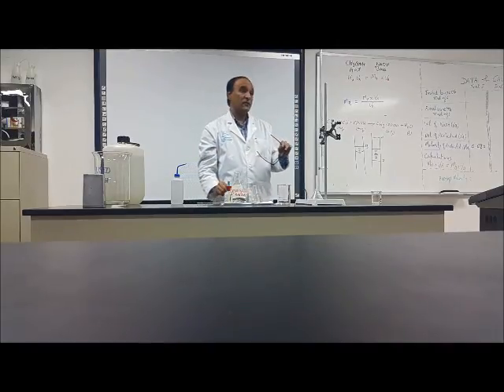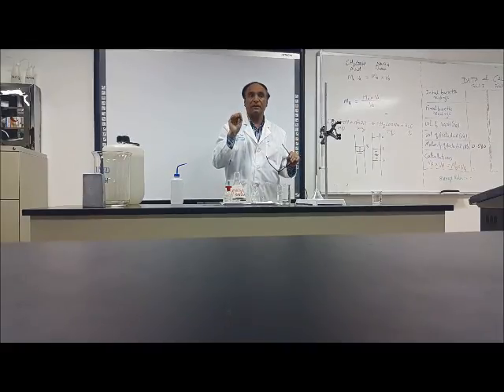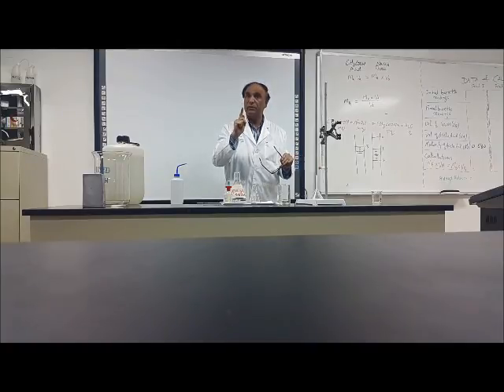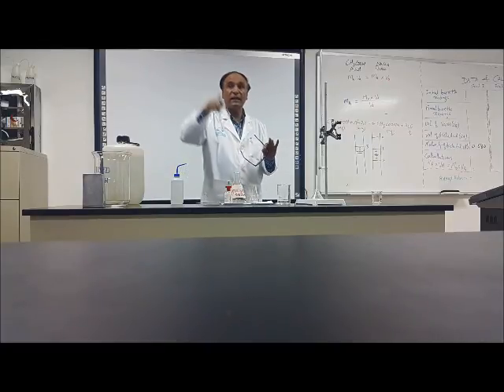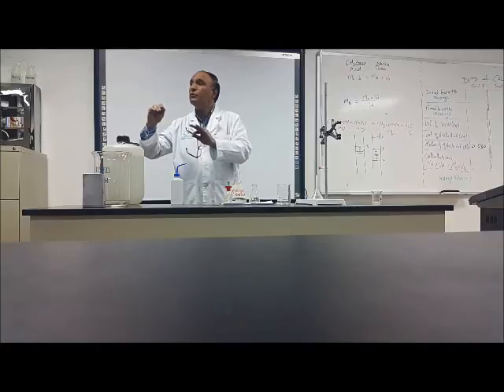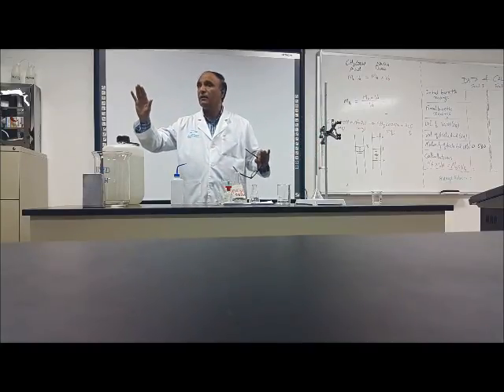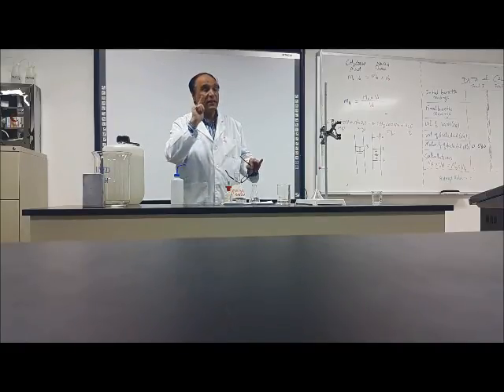You are doing the experiment for the first time. I will not care about the result. If the result is wrong, I will excuse it. But if the technique is wrong, I will cross it. So you are learning the technique. If you are taking it, your flask should be with you. Look at everything carefully, look at me, how I am doing, and you do the same way. And if your answer at the end is wrong, don't worry. I will give you full grade. Okay? But the technique should be correct.